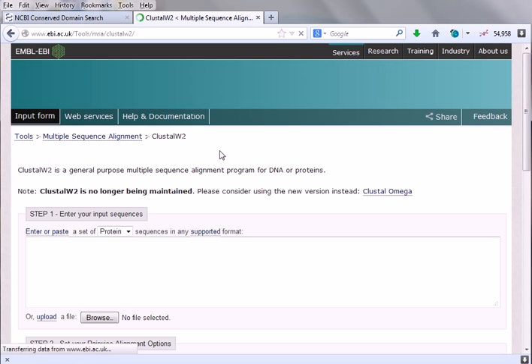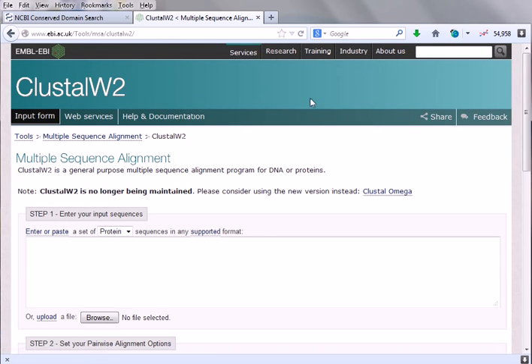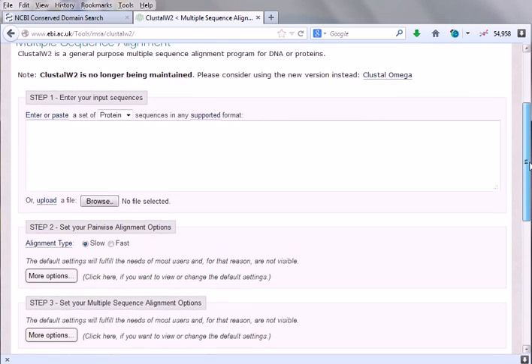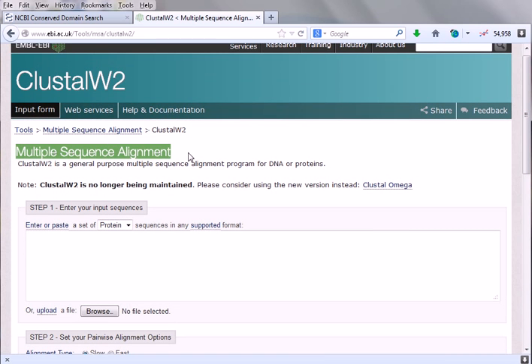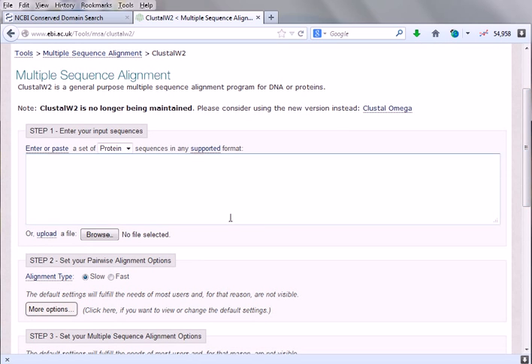This one is the actual page of ClustalW, so click the link above. This is the ClustalW website. This website is actually supported by EMBL, the European genome bank. This is for multiple sequence alignment. We know about the sequence alignment. We have seen the theory about multiple sequence alignment above. Now we will be doing it.